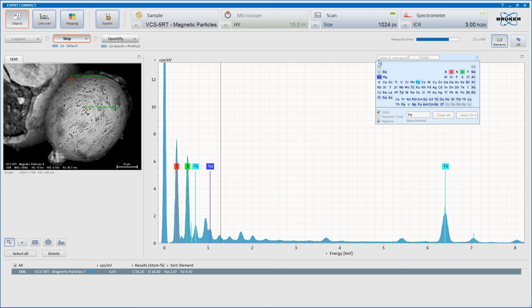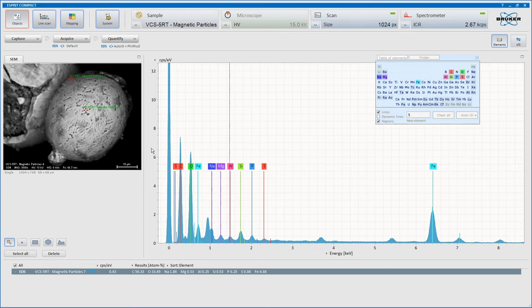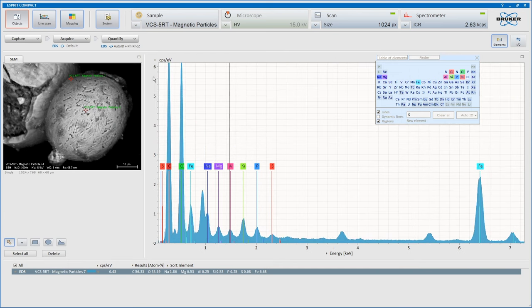Seeing sodium, but if I put magnesium on there, you see, magnesium looks like that line, right? Aluminium, yeah, looks like that line. Silicon is that line. And is that phosphorus? Yeah. These are the usual suspects you get. Now, have we got sulfur as well? Yes. A little chunk of sulfur there. Yeah.